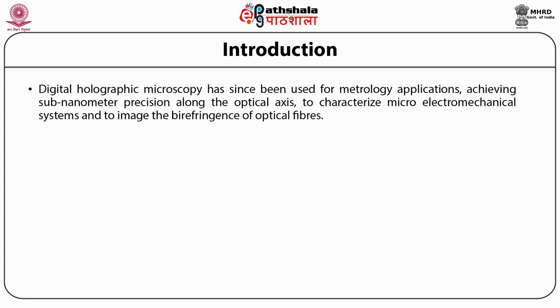Digital holographic microscopy has since been used for metrology applications, achieving sub-nanometer precision along the optical axis to characterize microelectromechanical systems and to image the birefringence of optical fibers.